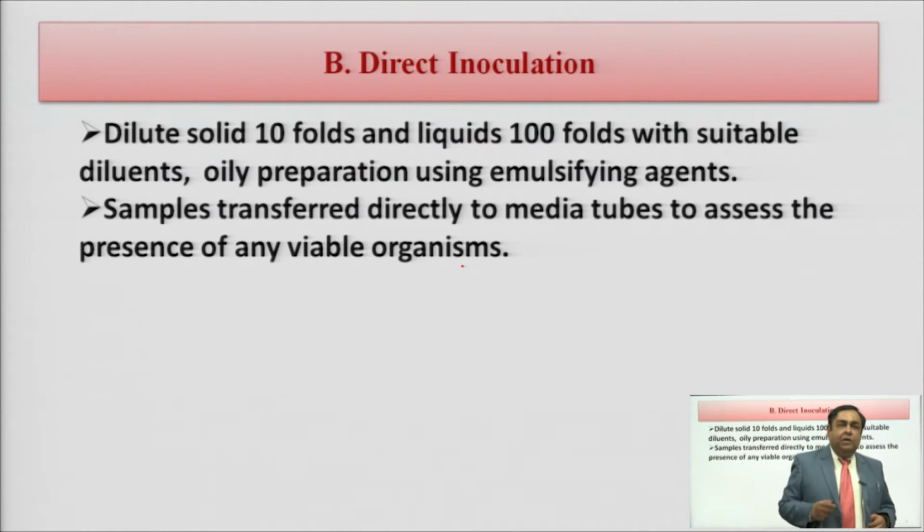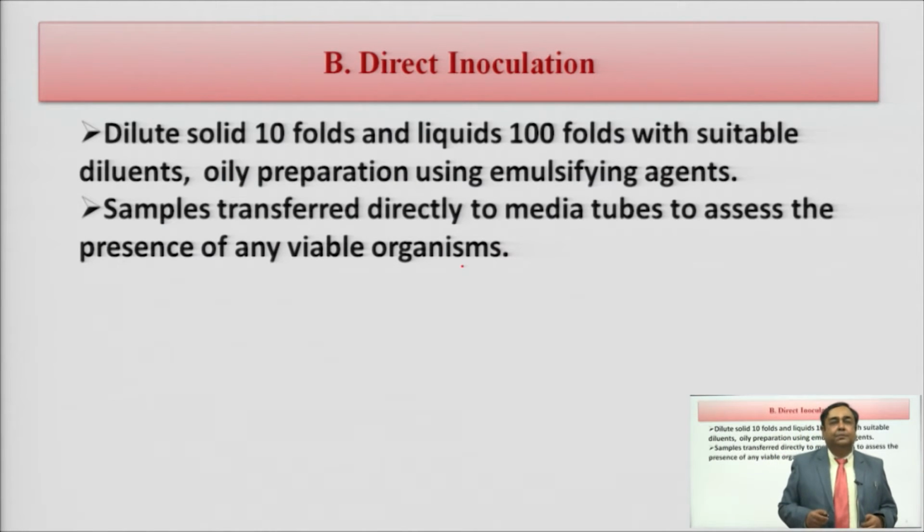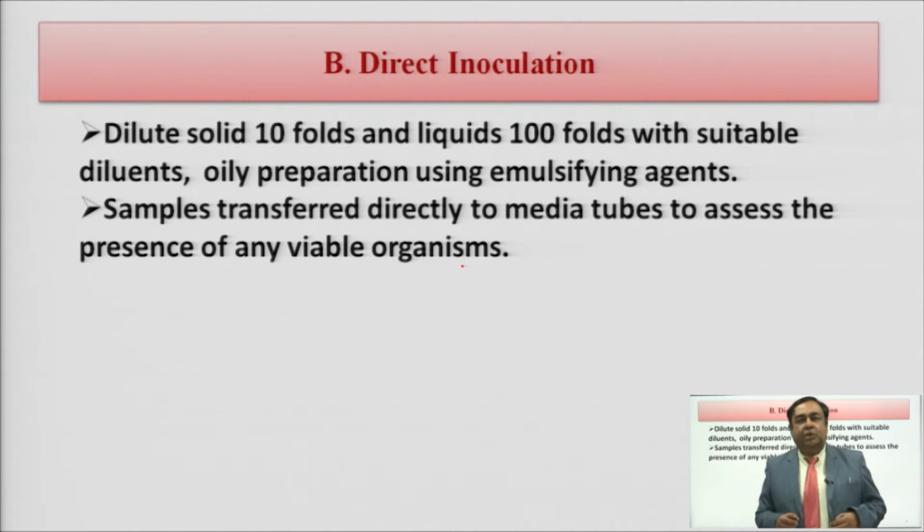Now, this is commonly used for solids, where you have to dilute it tenfold, and in case of liquid, if the volume is small, you need to dilute it 100 times with the help of any diluent.